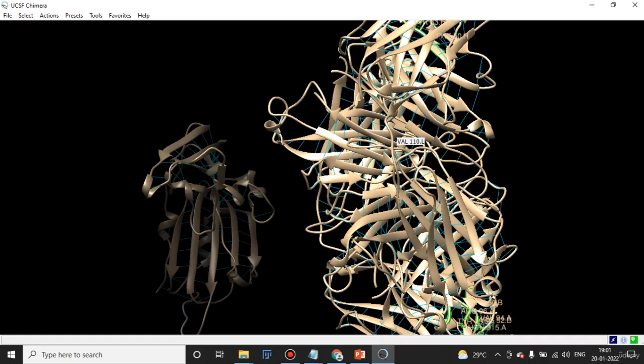That is, by submitting the Lyra file, by submitting the FIRE2 file. Please do that. Please submit the various receptor models that we have saved, and also various models that you should be saving, because we did not save the automated modeling result. You can take the model, save it, and then upload it and see. Anyway, this is how you need to visualize your structure.